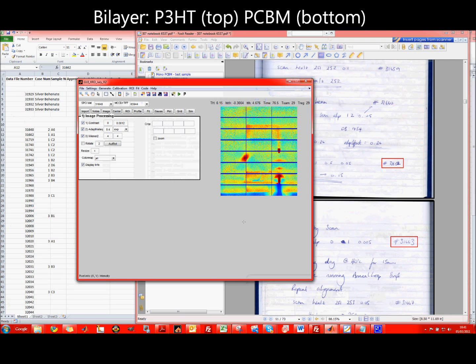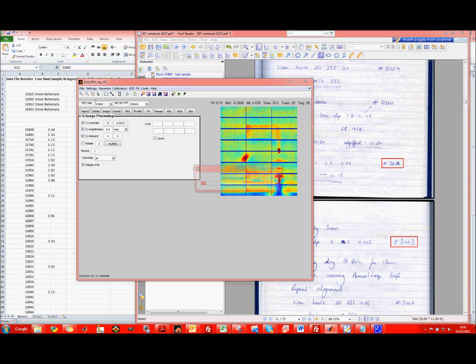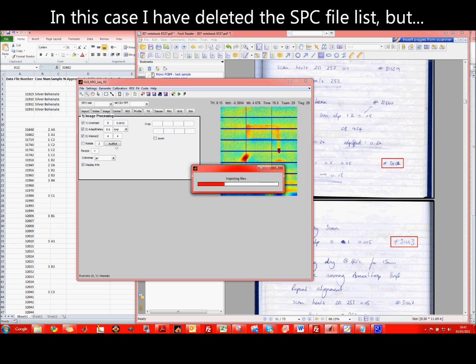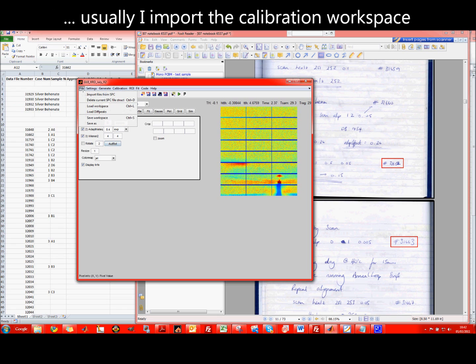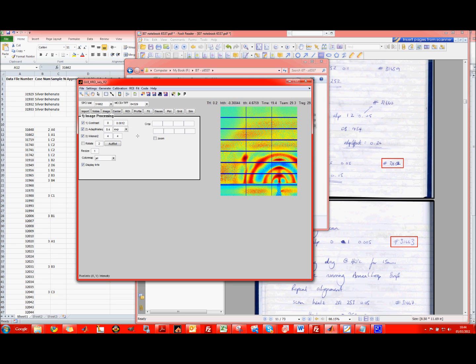So we delete this and we import 1662 and the other one. Okay, this is nice.